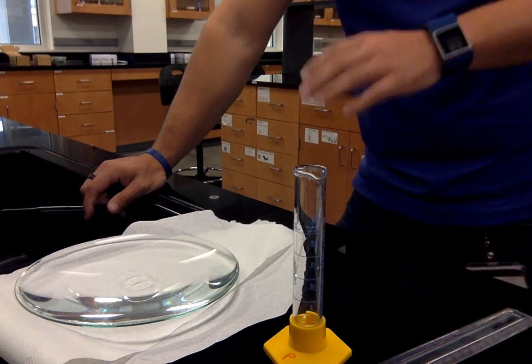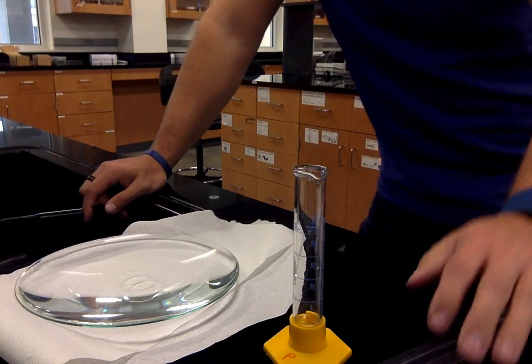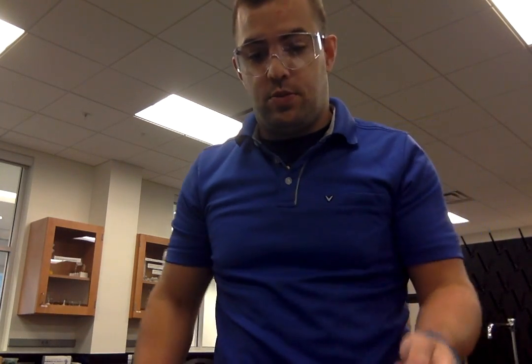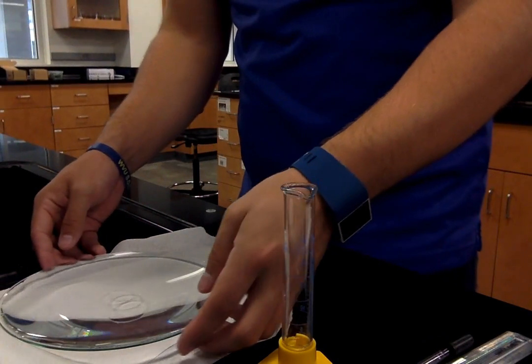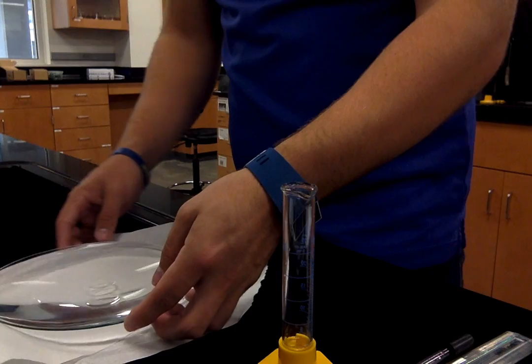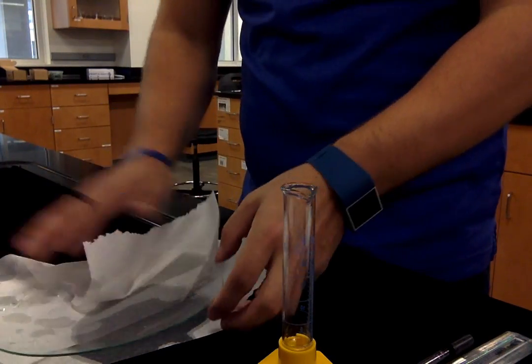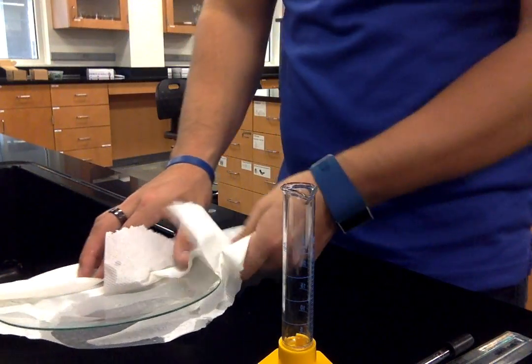Once you start to see it kind of persist a little bit, you'll want to slow down in your experiment so that way you know exactly what's going on. And my suggestion is to do this near the sink, so that once you're finished with your watch glass, you can just slide it over, because it's going to be very full, and dump it into the sink. Okay, since stearic acid, or rather stearate, is what we use to make soap, it's very much safe to go ahead and put that down the drain.